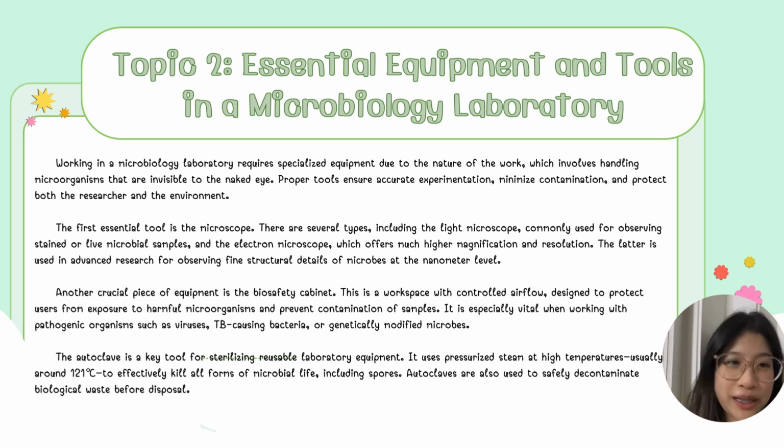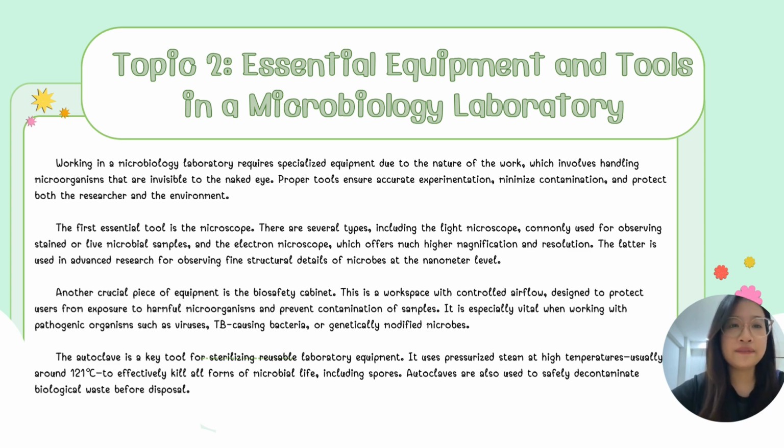Let's move to topic 2, essential equipment and tools in a microbiology laboratory. Working in a microbiology laboratory requires specialized equipment due to the nature of the work, which involves handling microorganisms that are invisible to the naked eye. Proper tools ensure accurate experimentation, minimize contamination, and protect both the researcher and the environment. The first essential tool is the microscope.